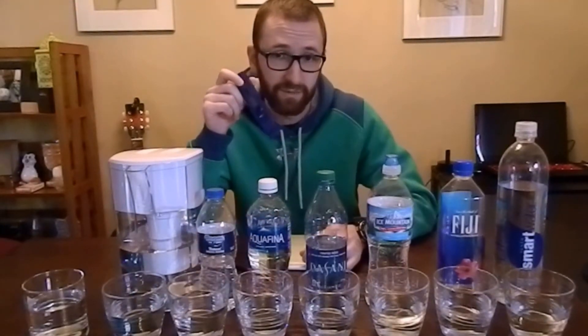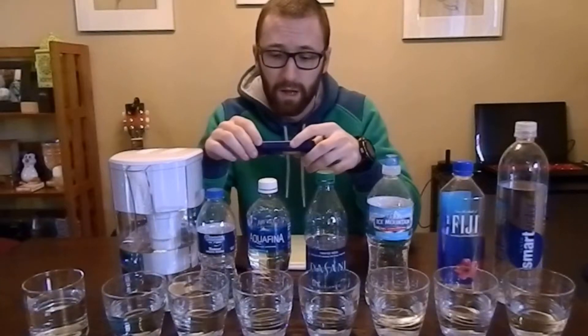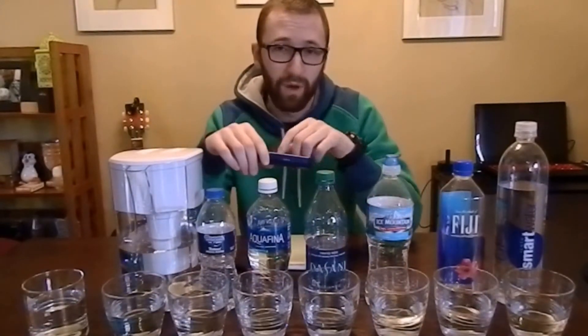This particular detector costs about $15 on Amazon. It's super easy to use — nothing complicated to it. It's like a thermometer. It even comes with a little guide on the back that gives you the healthy ranges. Anything over 1,000 is considered harmful, but the EPA recommends that you should be drinking water that's below 500.